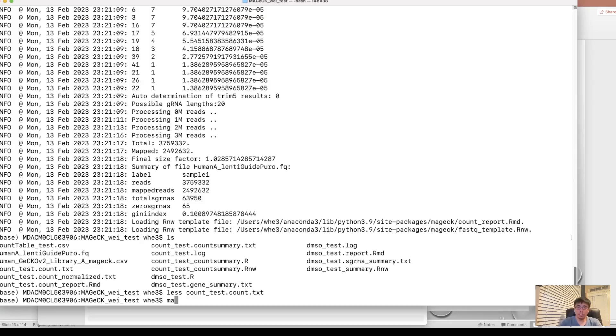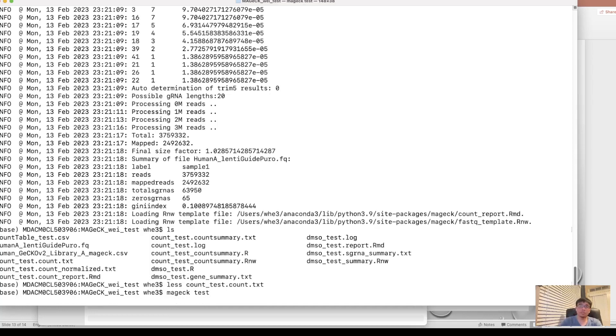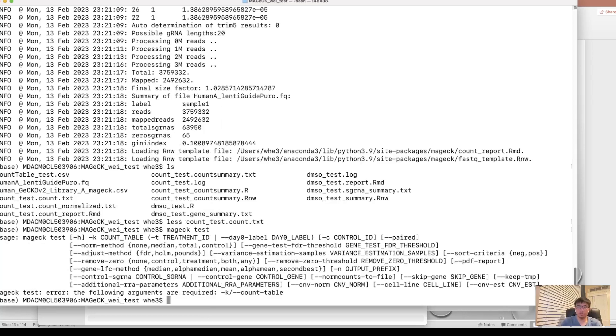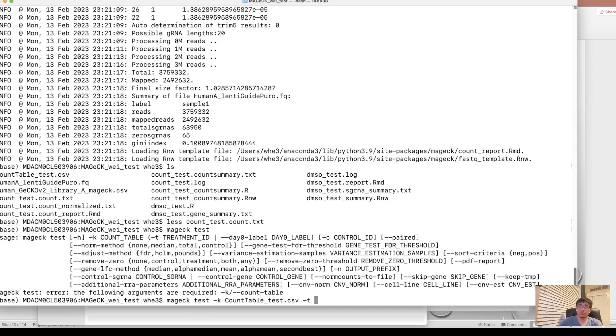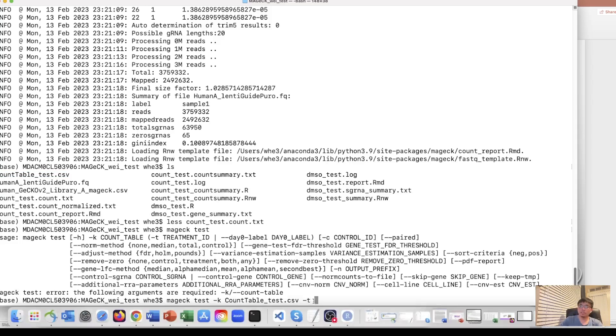So how do we do the test? Let's use MAGeCK test. So let's see what's the MAGeCK test, first, the required parameter is count table. So the count table we use is the count table test. And another parameter needed is the treatment condition.